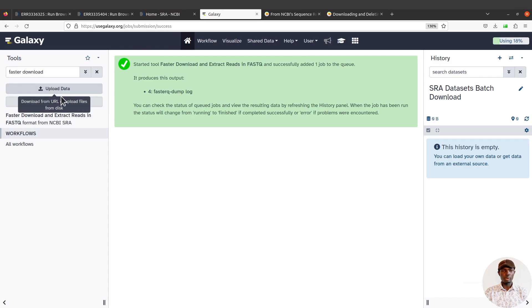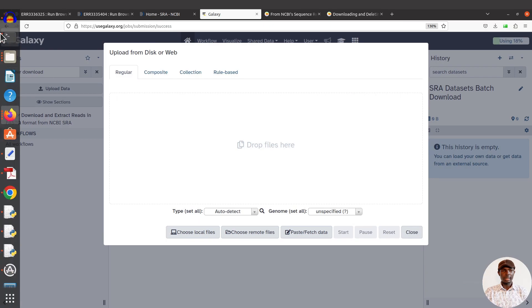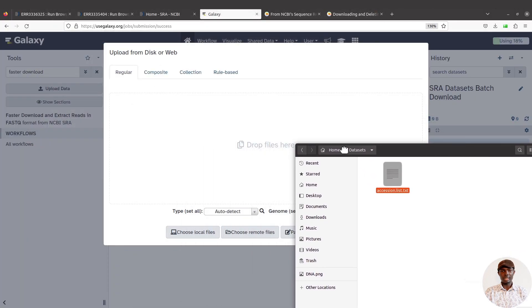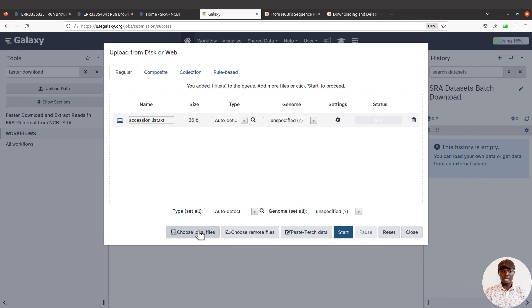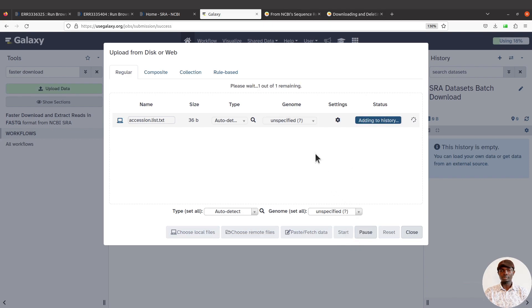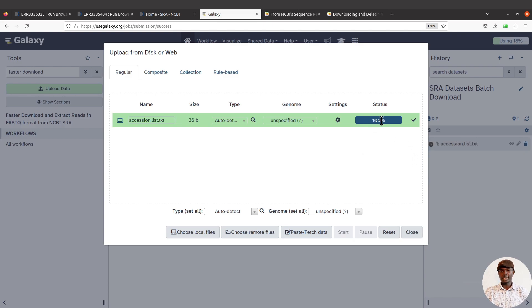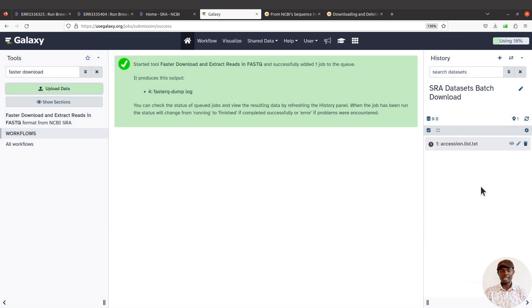On the Galaxy platform, click 'Upload Data'. You can drag and drop the file, or click 'Choose Local Files' to browse and select your file. Once the filename appears, click 'Start'. When it reaches 100%, close the upload dialog and wait for the file to appear in your history. Once it's done, you can click the file to verify your entries are all there.